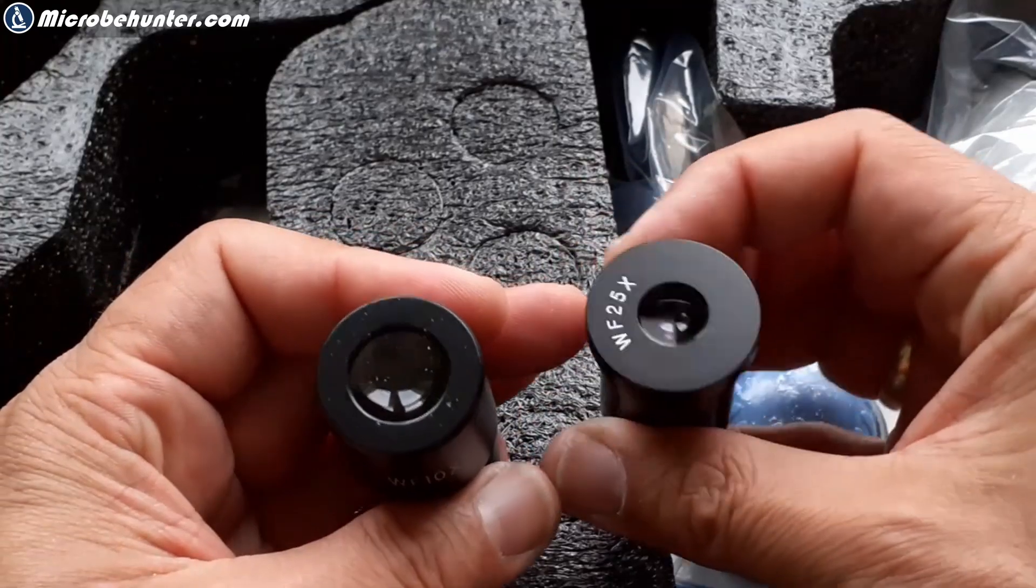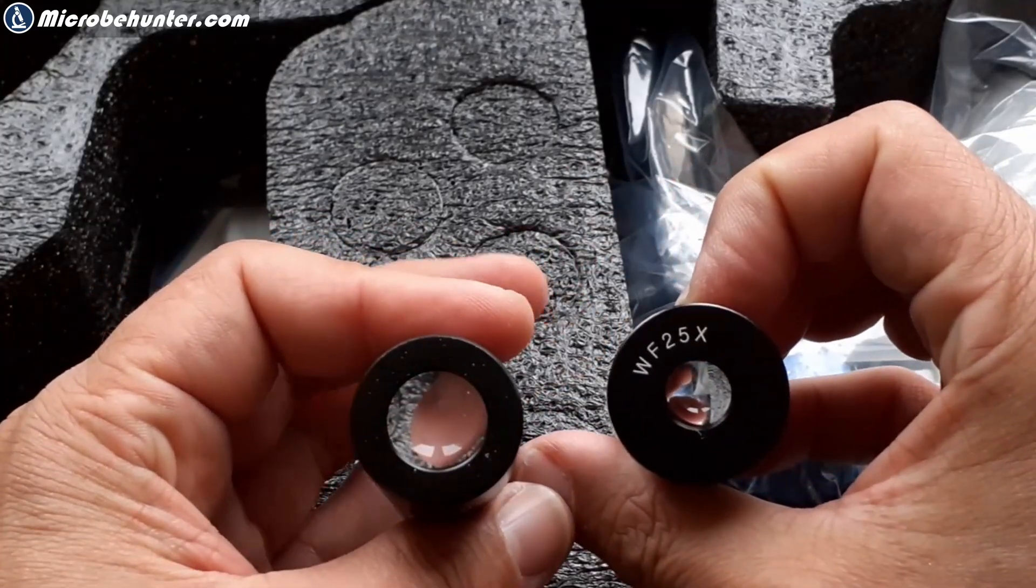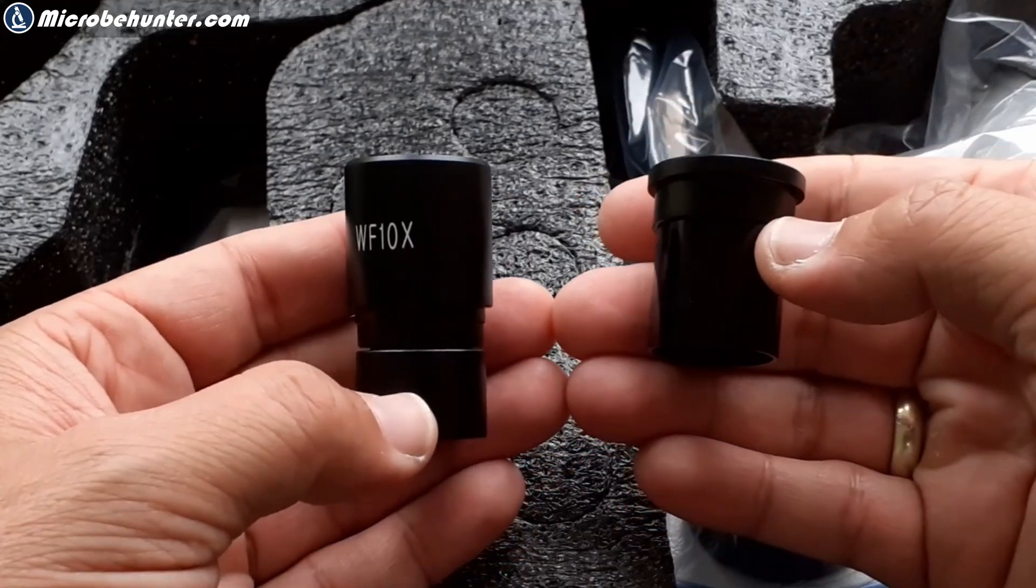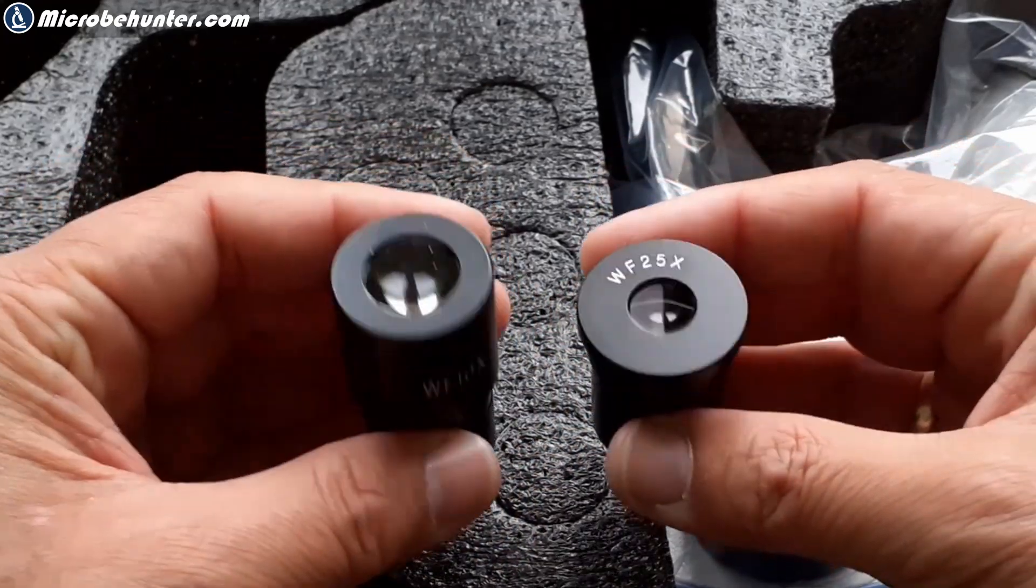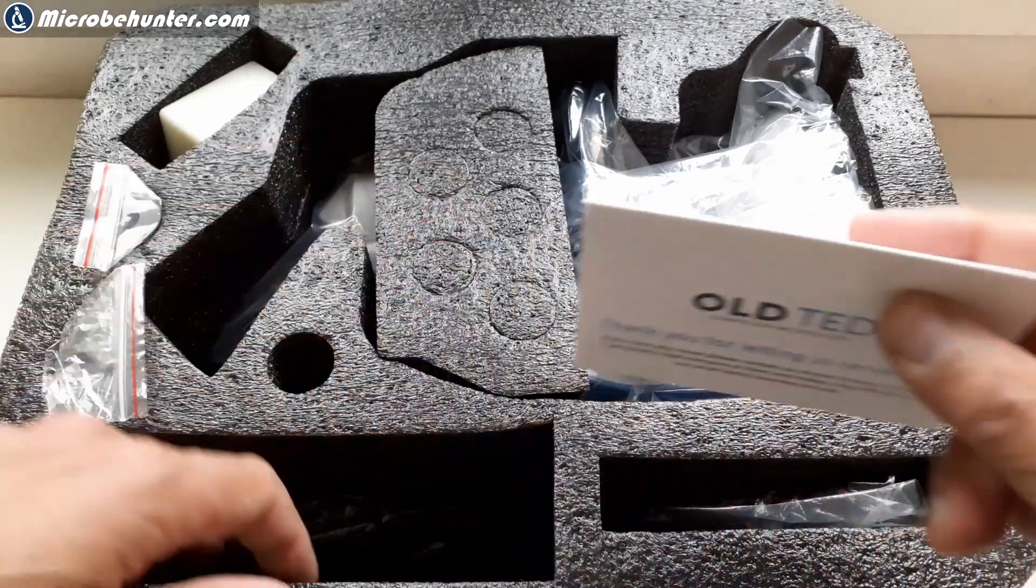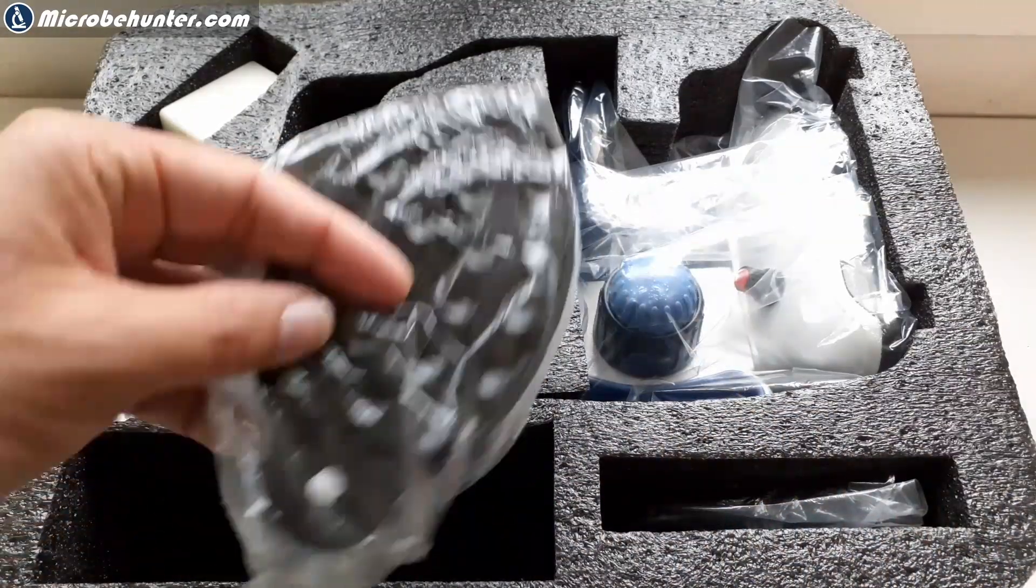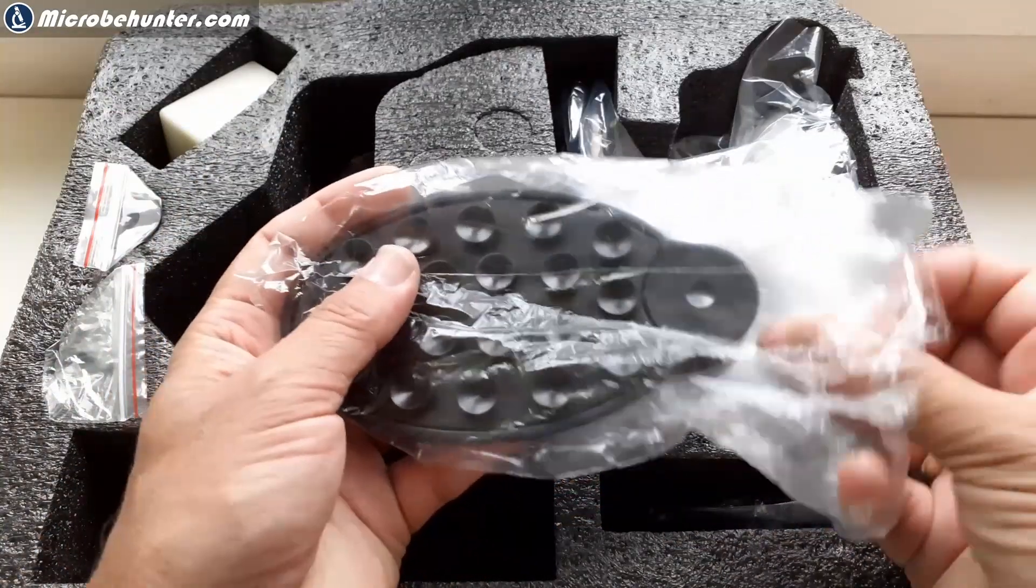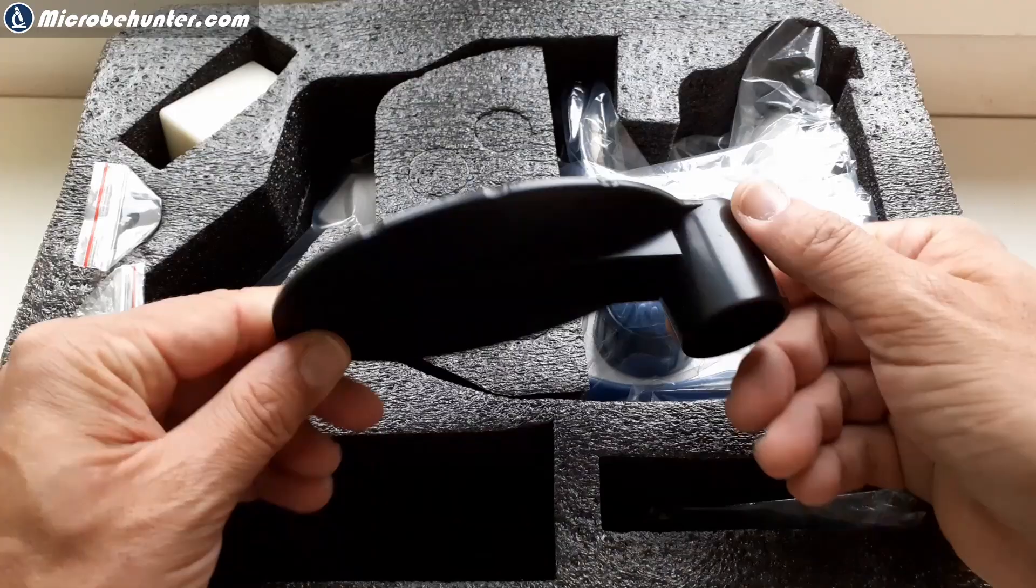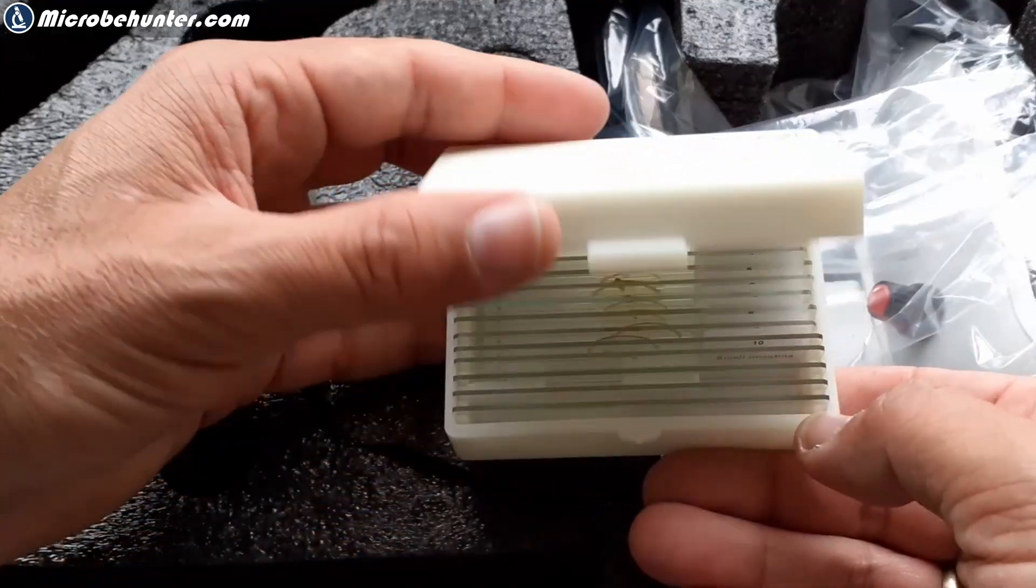There are two eyepieces, a 10x and a 25x eyepiece, which allows you to magnify all the way up to 1000x. I personally think that this is too high. 400x should be the maximum that you need. But it can't hurt. There's some short description, a card here. And this here is a mobile phone adapter. There are suction knobs on it that hold the mobile phone and it can be put directly over the eyepiece to take pictures.